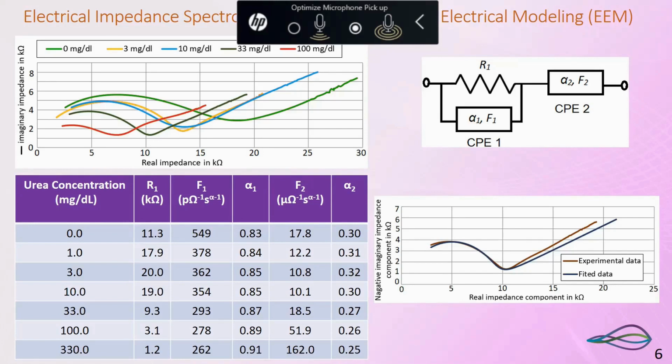But please pay attention here. These parameters are not readily available. If you take a meter and take the impedance at a selected frequency, at a particular frequency, we will not get these parameter values.